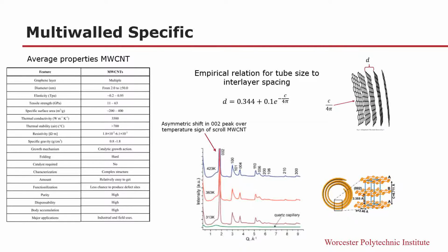In the diffraction data, the secondary peaks after the 002 are what define the multi-wall carbon nanotubes. These secondary peaks differ from graphite in that the peaks are broadened and smeared compared to the sharper peaks produced in graphite. In multi-walled carbon nanotubes, there are only certain chiralities which can exist to maintain intershell distances within the theoretical limits of 0.344 and 0.36 nanometers. Thus, there is a relation between layer spacing and diameter.